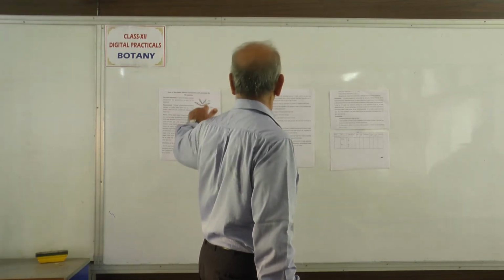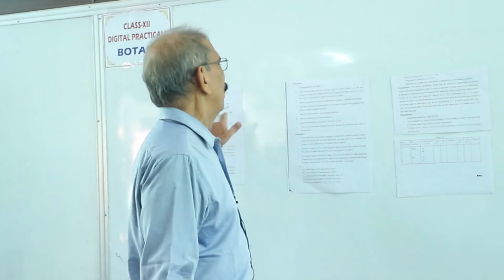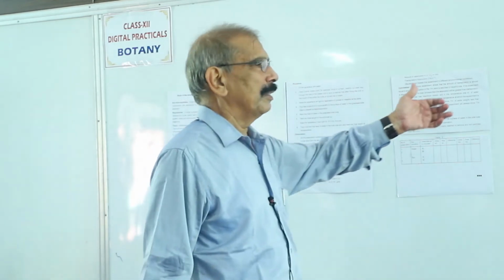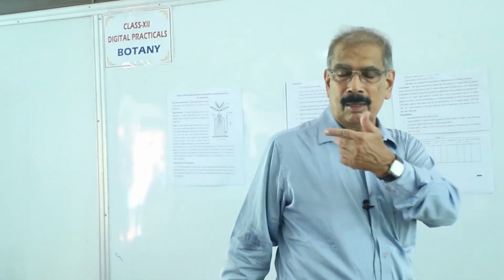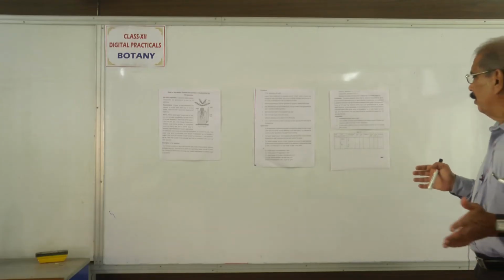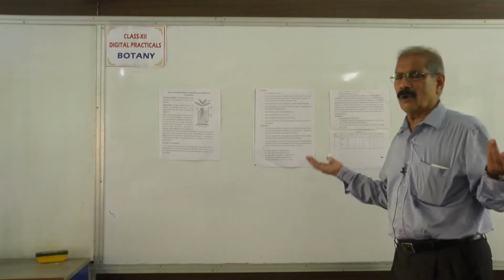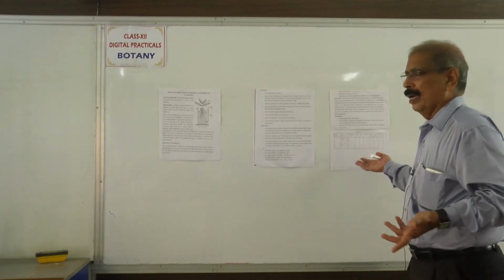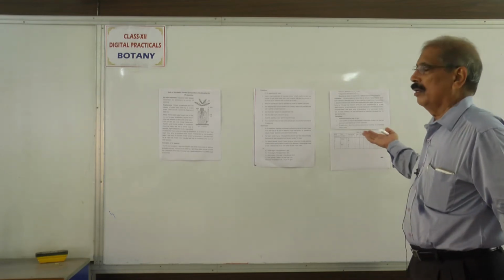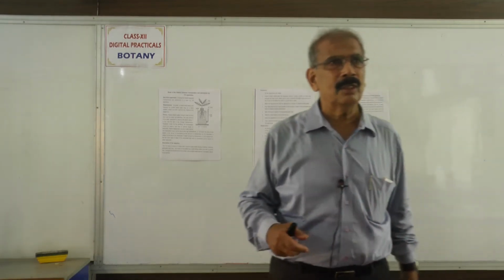Due to transpiration, the water level comes down, and that is recorded in this graduated tube. The weight loss, because water is lost from here, can be measured with the measuring balance. So that is the very simple principle. You can do it very quickly and very easily. You can keep it in shade, sun, different conditions. Particularly you keep it in the sun and take the reading, and this is the process of the first experiment, the transpiration and absorption apparatus.